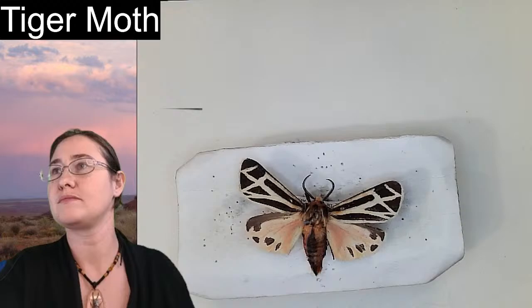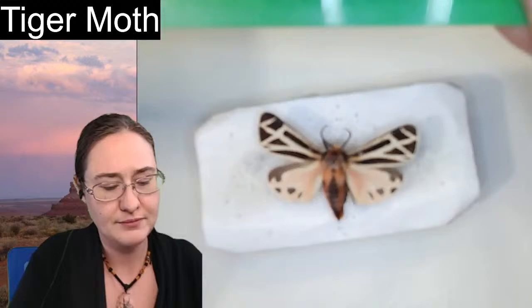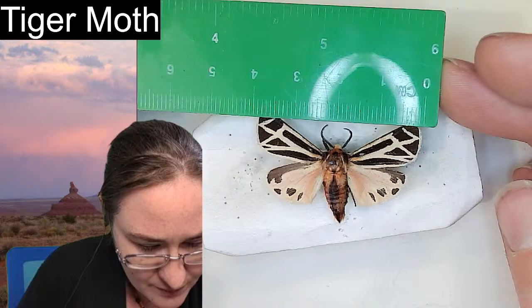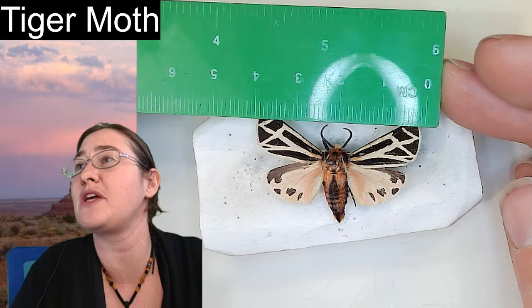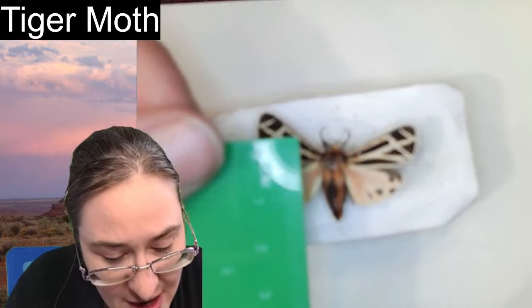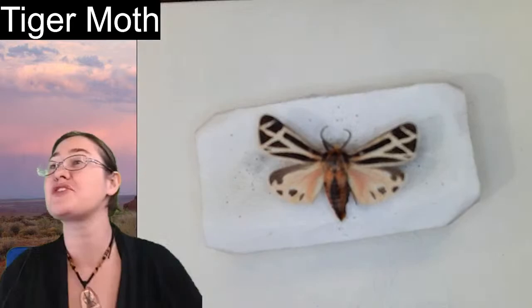All right, so I'm going to go ahead and give us a wingspan on this tiger moth. I would say this tiger moth has a 4-centimeter wingspan. It looks like 4 centimeters pretty much on the dot. And then if we wanted to give the length of the body from the front of the head to the back of the abdomen, it's about 2 centimeters.